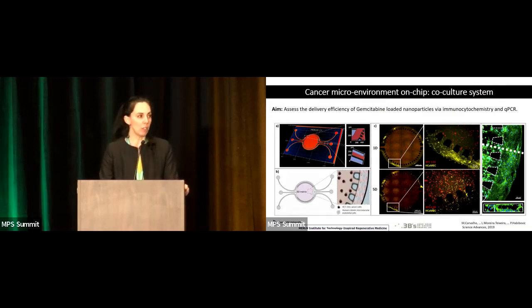And what we wanted to address here is how the drugs penetrate into a solid tumor. So colon cancer was an example of a solid tumor. It can be extrapolated to many other solid tumors, of course. And the idea was to see how a nanoparticle would diffuse inwards. And the idea was to recreate a window into a tumor, like we would cut halfway and see the penetration of these nanoparticles.